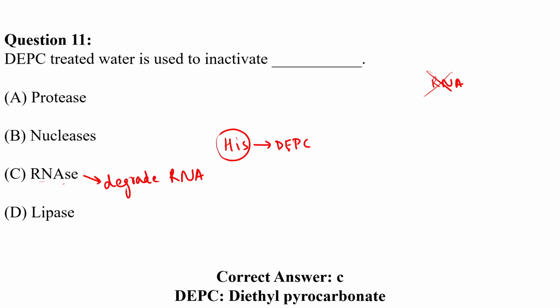So, RNase is a very common enzyme. It is present everywhere, and when I say everywhere, I literally mean everywhere. It is present in your hand. So, when you are doing RNA isolation, it is always suggested that you wear clean fresh gloves, use DEPC treated water, use everything fresh and sterile, autoclave everything, sterilize the surface and the micro tips, because RNases can be present anywhere, and even a single molecule of RNase coming in contact with your sample will degrade it. That is why removing or inactivating the RNase enzyme is very important, and DEPC is the best option to do so.